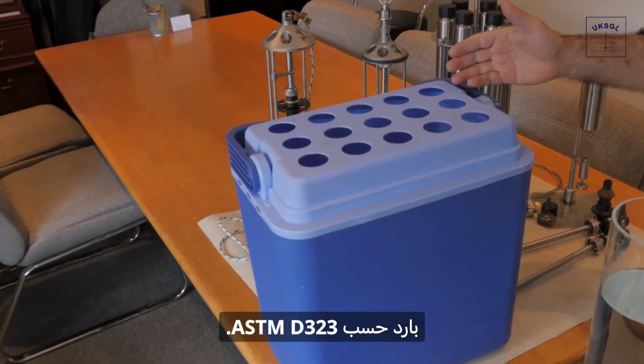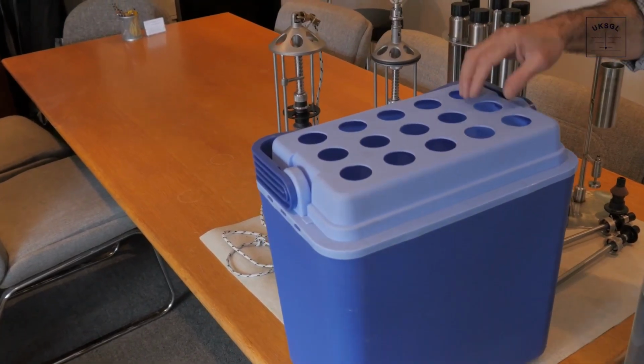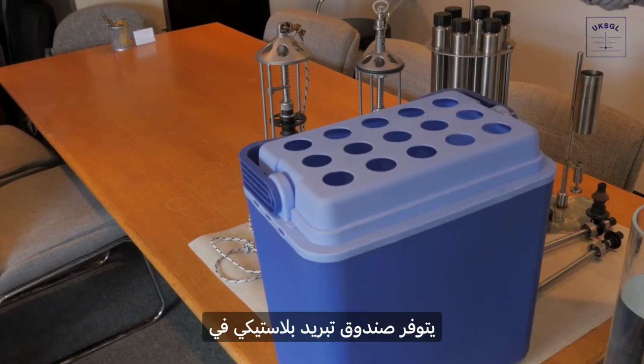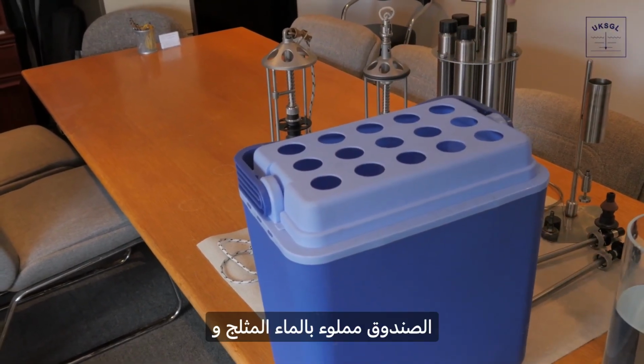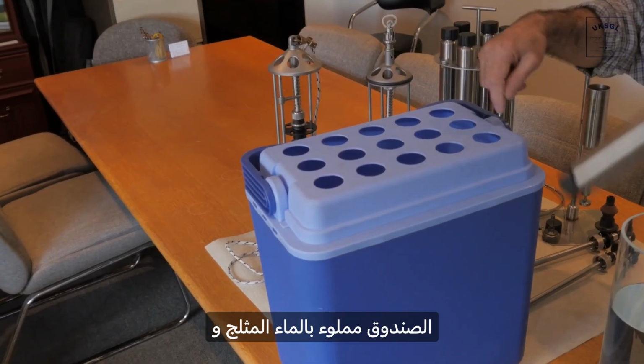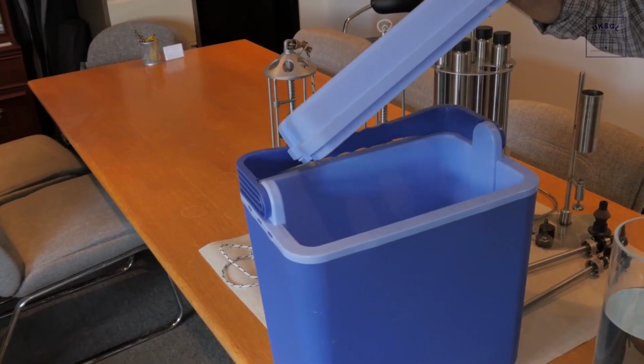In the time between the samples being taken and being delivered to the lab, the samples should be kept cool as per ASTM D323. A plastic cooling crate is available into which the tubes can be stored. The crate is filled with iced water, and the tubes are placed inside with the black caps at the bottom.